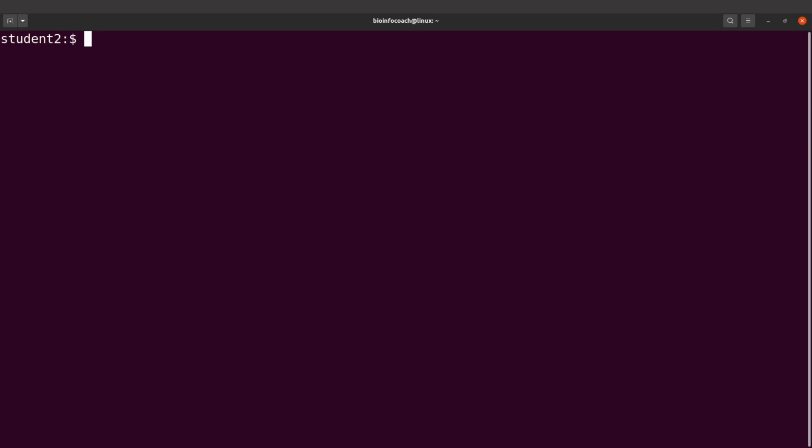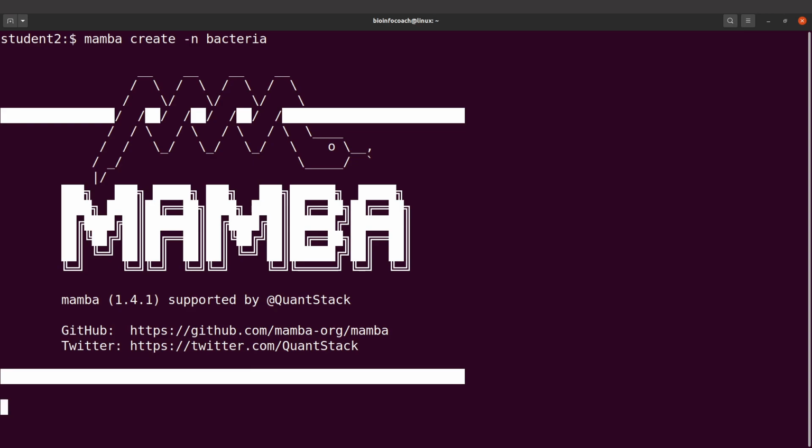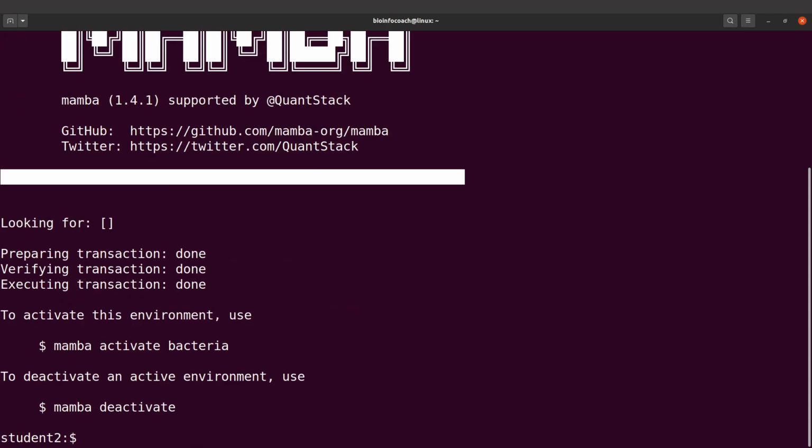All right. So I'll begin by creating an environment. So I'll say mamba create -n, and I'll say bacteria. This is the name of the environment. So let's execute this command. All right, the environment has been created. So I'm going to activate it using this command.